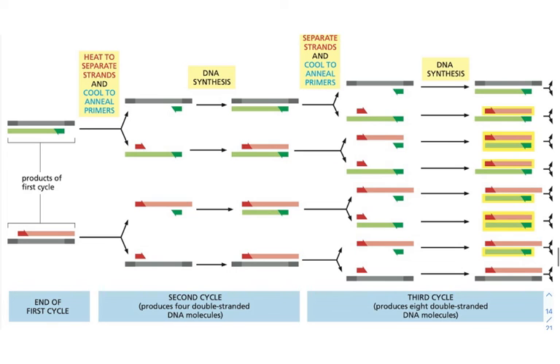And we can transform plasmids. Like I said, transformation is inserting DNA into a foreign cell that it didn't come from, and we can have that cell express that DNA. So for example, we can have the insulin gene put in on a plasmid, replicate it with PCR many times over, and then put it in a bacterium that can overexpress the insulin protein for our use as humans.